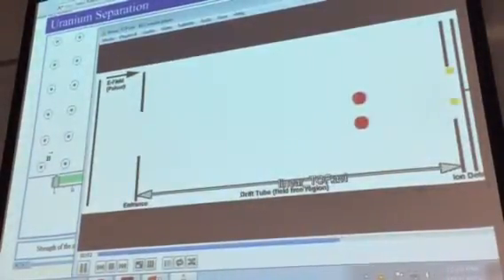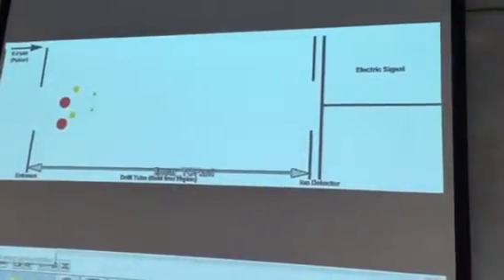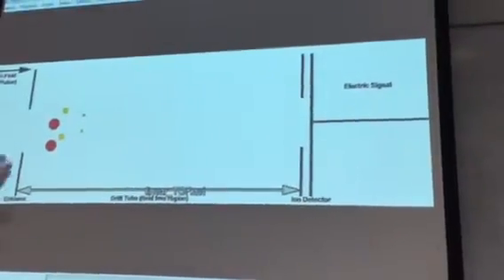Oh, it's going to let me do it, great. So here's a nifty little animation. Let's see, it's not getting there to click. Hang on one second. Where's my pause? It's right there. Boom. So you generate ions, three different ions, and sorry I didn't pause it earlier.